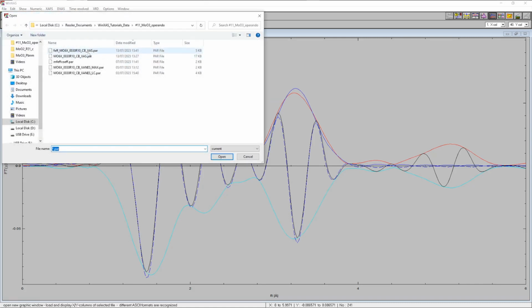So you find two new parameter files. One contains all the parameters from the XAFS refinement: all the distances, the Debye-Waller factors, coordination numbers, and everything in the XAFS refinement, also those shells that were kept invariant, so they are all listed here. In addition to that, the program generates a second file that only contains the free running parameters. So we are going to look at those.